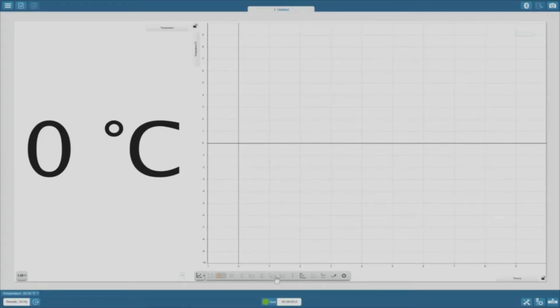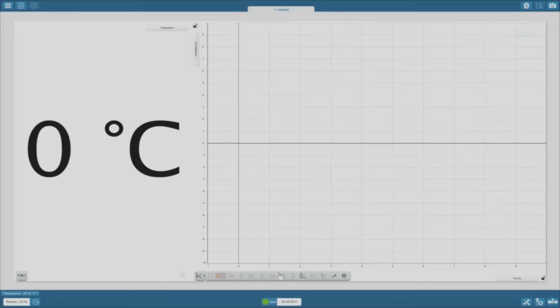This button is the line of best fit tool. It will give a line of best fit through all our data or just the data we select. If you'd like to know more about these other buttons, you can check Appendix B at the back of your lab manual.